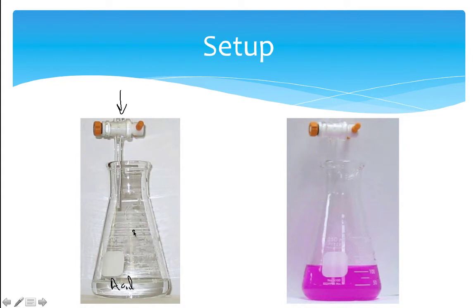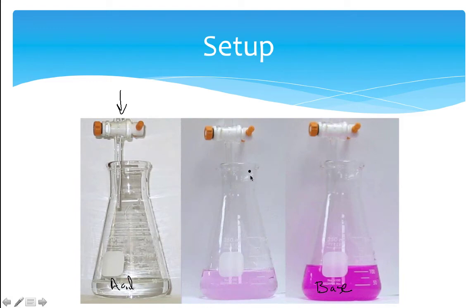As you add more and more of base, eventually the acid will be consumed, the pH will suddenly jump up to a much higher number, and you'll now have a solution that is filled with base, and we can see that because of the color change. Our job is to get to the point where we just start to see this happen, and what you're going to be looking for is this very light pink color, and this is going to be our endpoint.